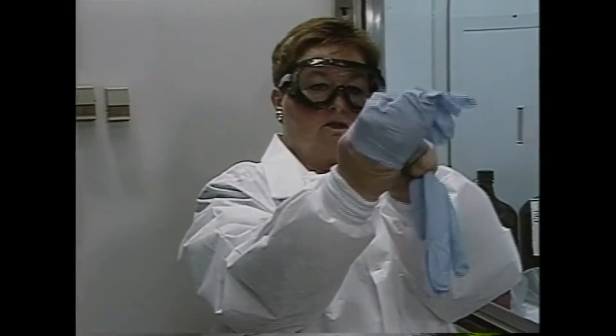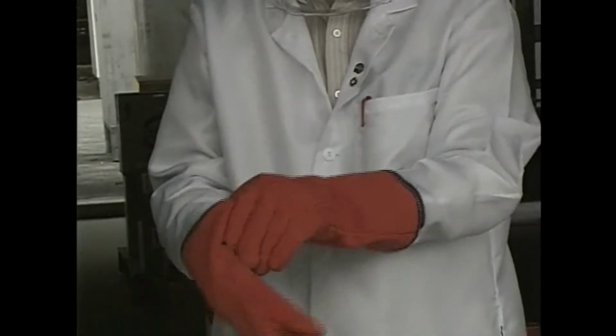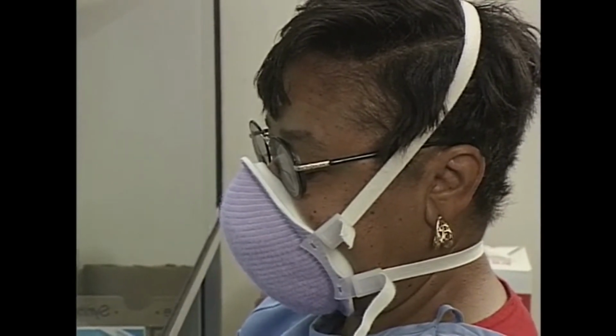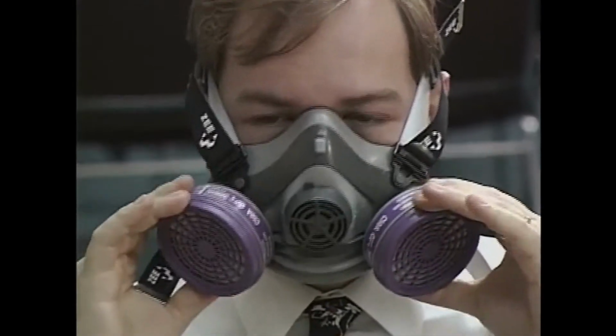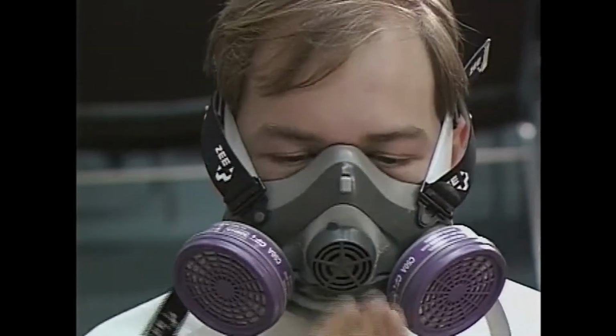Surgical and other rubber gloves can protect your hands from most contact hazards. Insulated gloves are needed when working with very hot or very cold materials. Respiratory protection in the lab ranges from the simple filter mask to the air-purifying cartridge respirator to the self-contained breathing apparatus. No matter what kind of respirator you use, you must be tested for a proper fit. If a respirator does not fit correctly, it will not protect you. Hazardous fumes may leak in through gaps between the mask and your face.